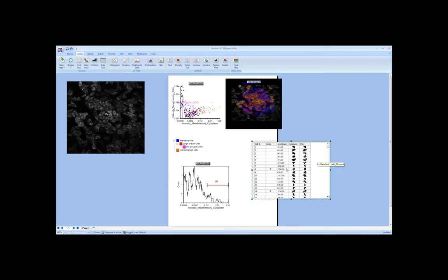This cell gallery is going to let us view all the gates. An orange block here indicates a cell that comes from this interesting histo cells gate. We've chosen to just show the area shape parameter here, so we're showing the multi-parametric data associated with these cells, and we're showing the individual cutouts for these cells. With this entire experiment, we can find this one interesting cell, we know its area shape, and we know that it's an interesting cell that's large and dim, dim for DNA and dim for cytoplasmic staining.